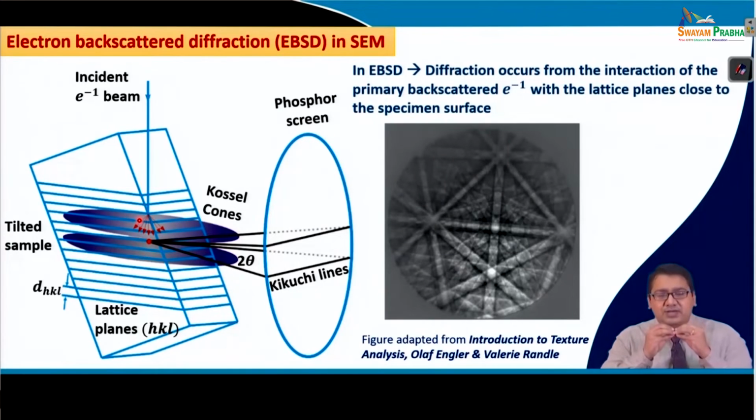And if the electron comes out after the final scattering, it is a reinforced scattering because of the presence of the periodic lattice arrangement of the atoms in the crystal. In this case also, many electrons are coming in the upper direction and few are coming in the lower direction, and it is throughout.